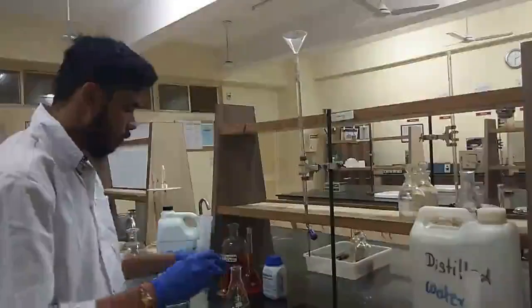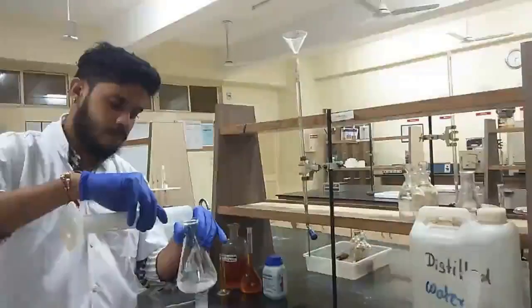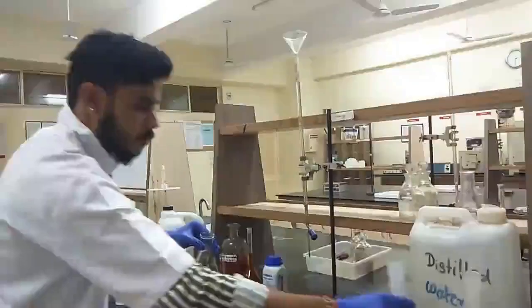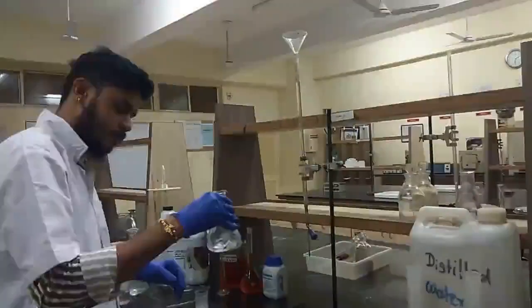Now this is required to suppress the sublimation of the iodine. We are going to stir the conical flask properly so that all the KI crystals dissolve properly.